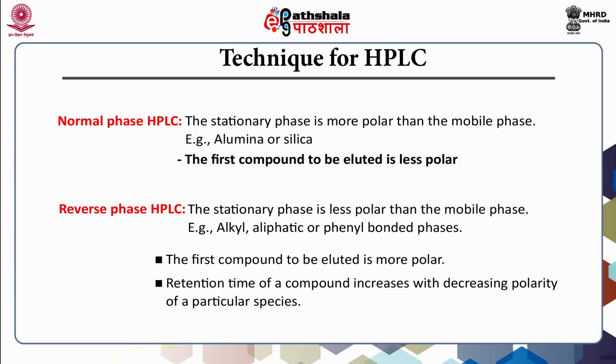So, that is about different techniques of the HPLC based upon the mobile phase and also based upon the stationary phase. So, let us see what are the properties of the stationary phase in case of HPLC in the next slide.